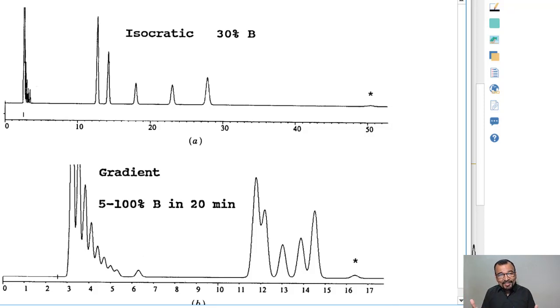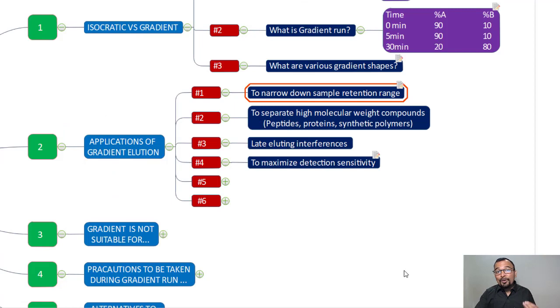You can see, right? Though it is marked with an asterisk just to identify the same peak which was eluting at 50 minutes, it has now eluted at 16 minutes with a better, significant response. So gradient elution also helps you in increasing the responses for trace amounts of the compounds. And this is the way you will benefit just because of using the gradient elution mode.